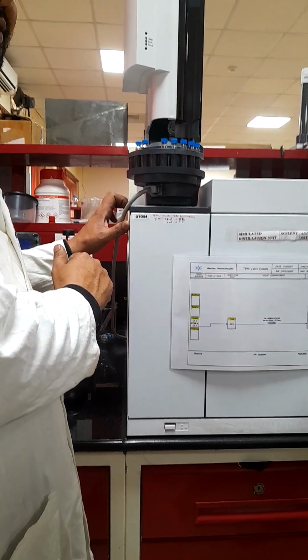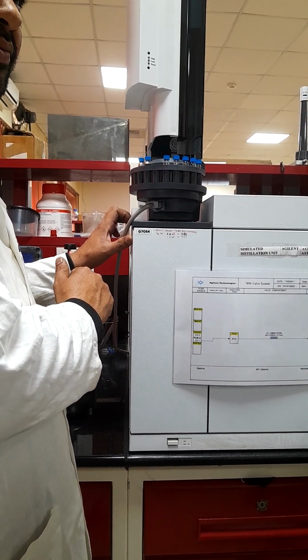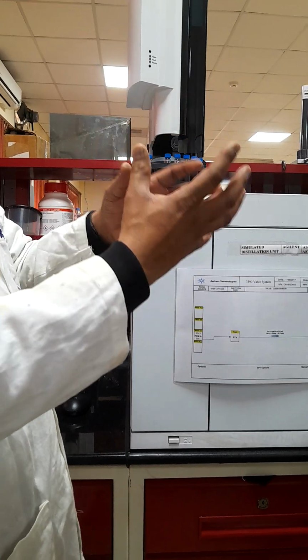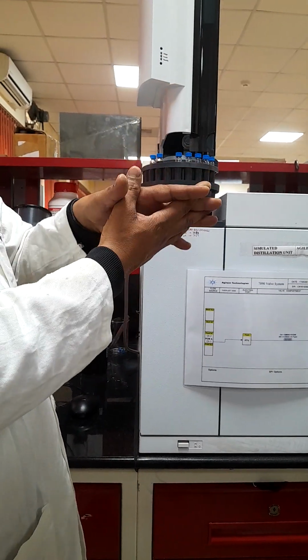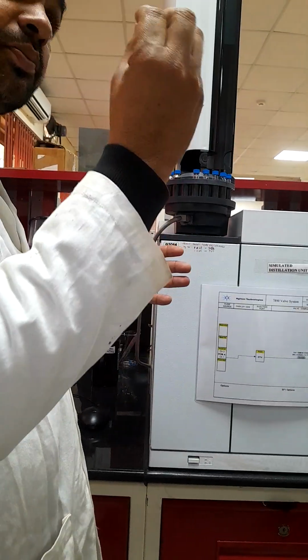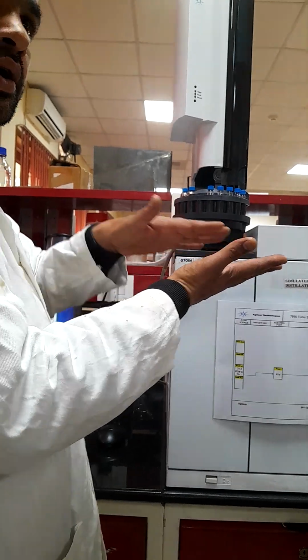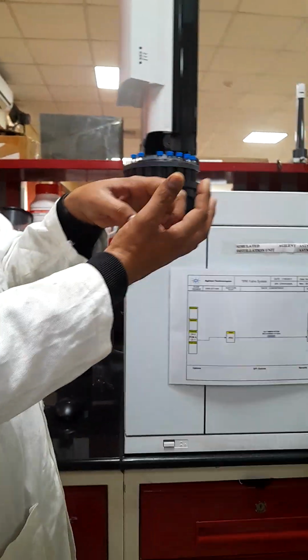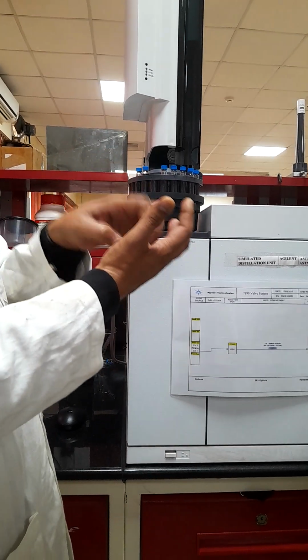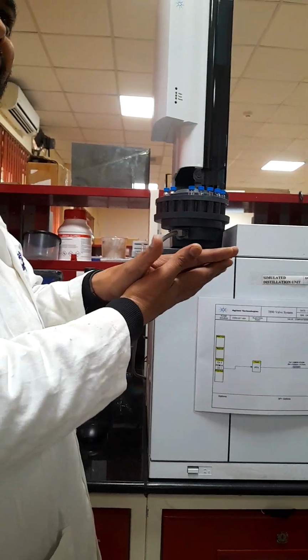I already told you earlier, the column is absorbing those molecules, and the lighter molecules pass through. It is attaching to the molecule, but not permanently. It is temporarily bound to the surface. Because if it has different components, everything will bind. But which will bind more? Heavier will bind more? No. Polar will bind more.